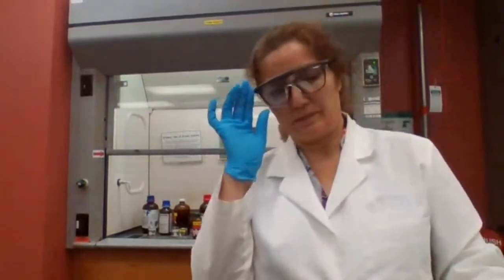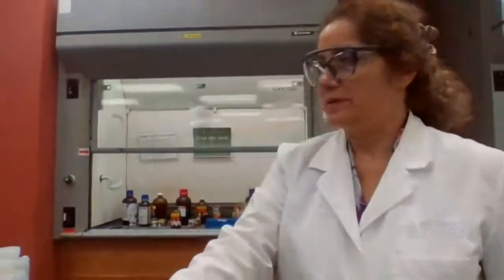I didn't have to dissolve it. I added directly to the chemicals because the chromic acid is the aqueous solution itself. Sometimes when we dilute, we get less of the color change. The color change is not significant. It makes it hard. So I just added directly. Because for alcohols, when I added directly, it worked better.